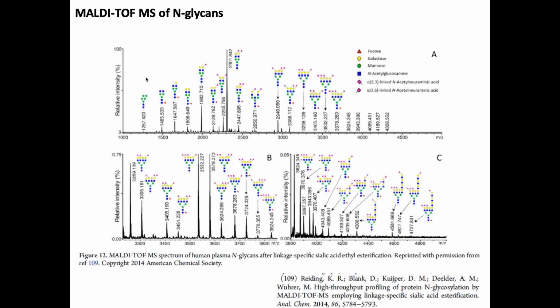This is just some data to give you an idea. Again, these are glycans that have likely been released from some type of protein, probably plasma protein. So I guess it's all of the human plasma glycans. They probably took a blood sample in EDTA, spun it out, and pulled off the plasma.